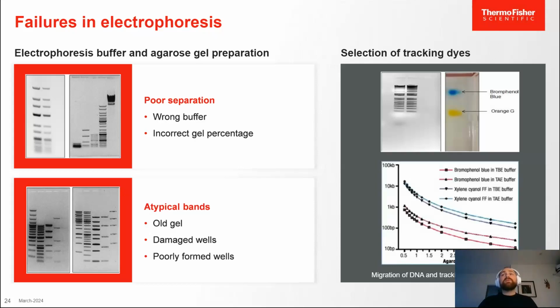So this is an important thing to consider, so that your fragment lies somewhere in between them. In the majority of cases, it is exactly that. In my long experience, I didn't have issues with this. Generally speaking, it's not a big problem, but if you have extremely small or extremely large fragments, it is important to understand that this can arise and to tackle it accordingly.